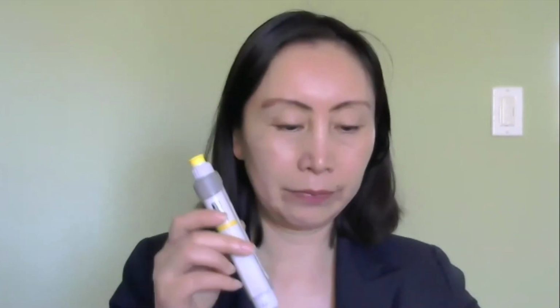So I will use the yellow micropipetter and I need to change the reading to 0230. That's 23 microliters. I need to press down to the first stop and then get into this tube, release my thumb all the way up, and there comes 23 microliters of primer mix.